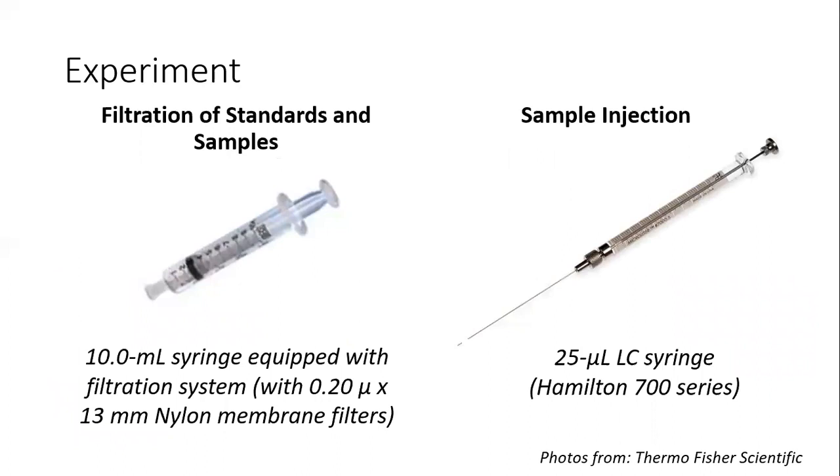So, if you will perform a manual injection, ito yung gagamitin na sample injection syringe. Okay, so medyo mahaba yung needle for the syringe. Okay. Then you also have this other syringe. So this is used for filtrating your standards and samples. Okay. So usually meron pa ditong parang septum which contains your filter paper. Okay, so Whatman filter paper.